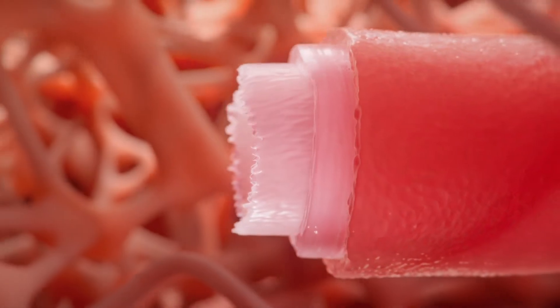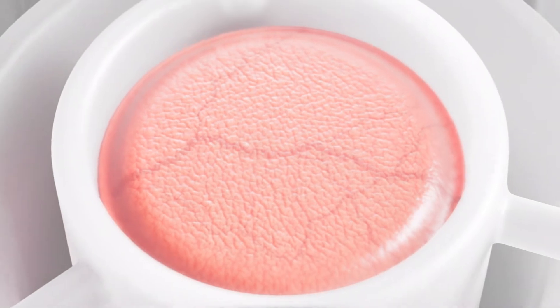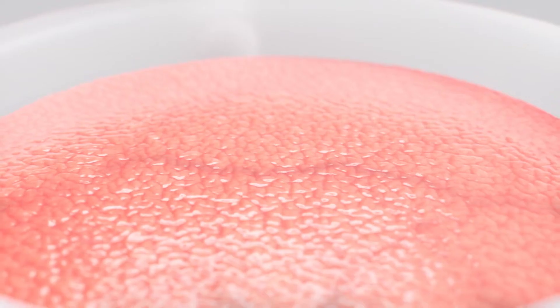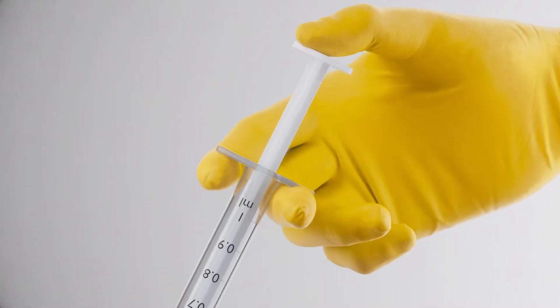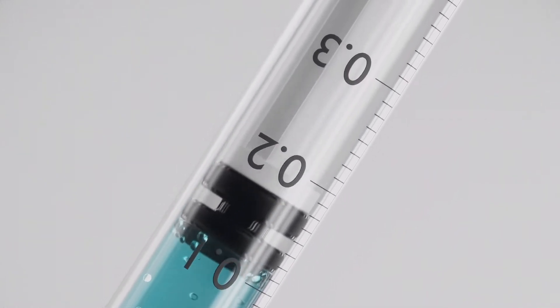Patients' own cells can be used to bioprint tissue, reducing the possibility of a negative reaction during a transplant. The printed tissue can also be used for individualized drug testing.